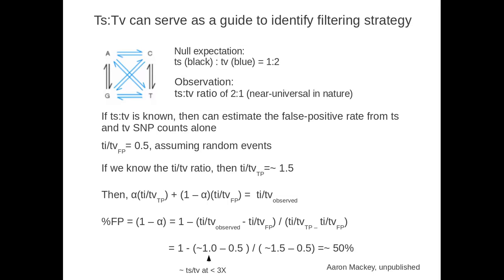In human data sets, you see filtering steps as well. People have developed set protocols for how you can filter, in addition to doing those more complicated things like base quality recalibration and variant quality recalibration. But in any event, the filtering step is critical to getting high quality data, and hopefully the last few minutes of lecture have shown you some of the tricks that we're using and how variable it is; what filters different people apply to the data are largely specific to those data sets.